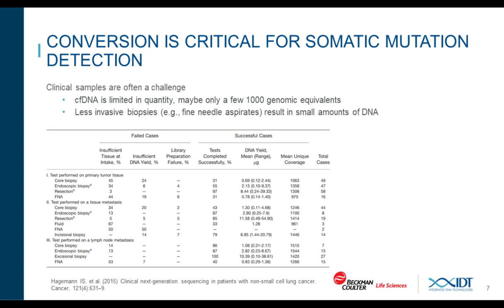Conversion is critical for somatic mutation detection. Clinical samples are often challenging because not only are they invasive, but they result in small amounts of DNA, where cell-free DNA is limited to maybe only a few 1,000 genomic equivalents.